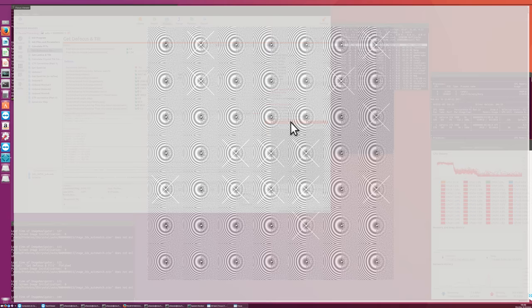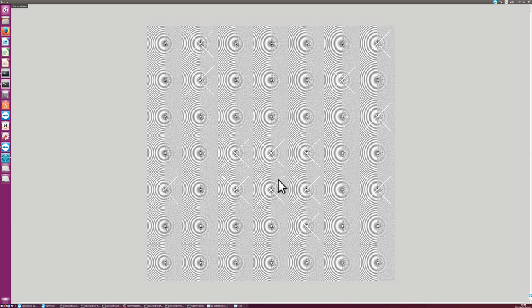On all these defocus measurements, there's another program that fits a planar plane, a tilted plane, across these defocus measurements. The measurements that are outliers from this fit are crossed out. And then the fit is done iteratively with the remaining positions until there's a good fit to at least half of the defocus values here that lie on a plane.